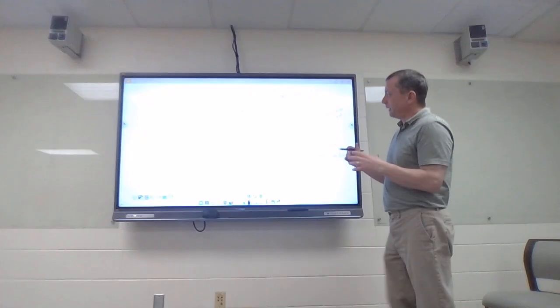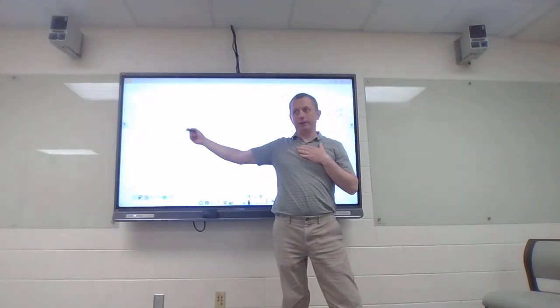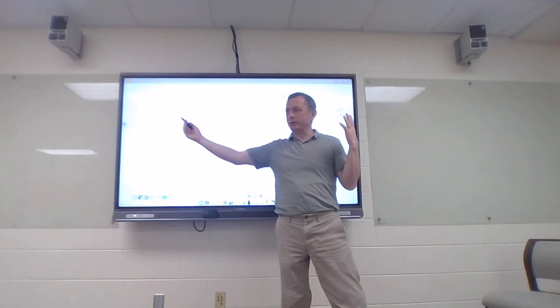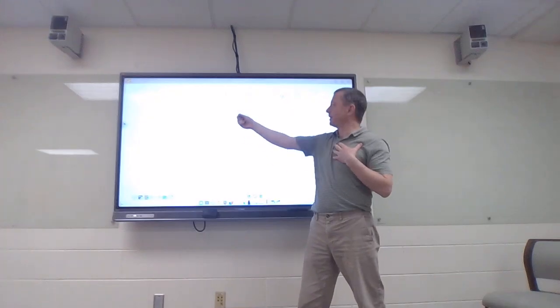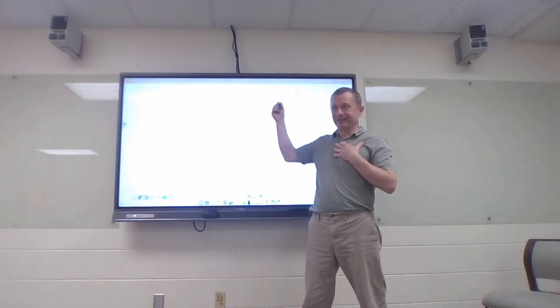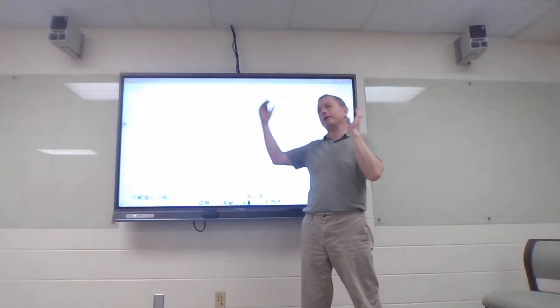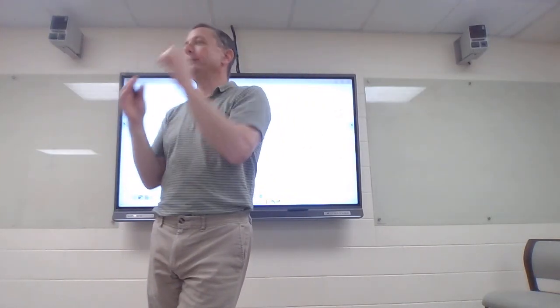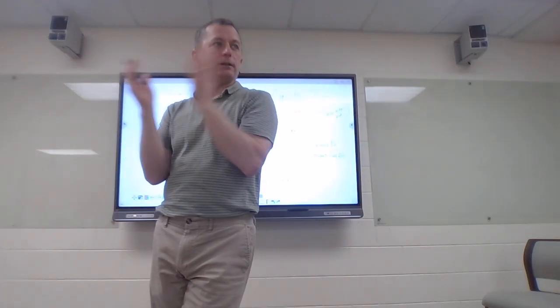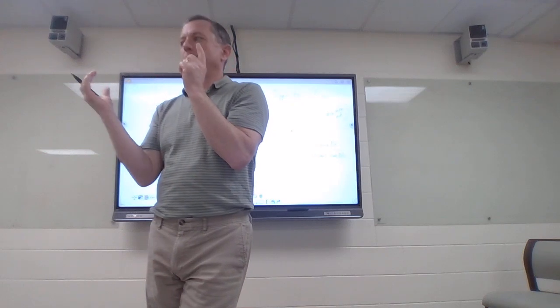All right? Now, I want to be clear. Most of the splitting we're going to look at is due to another hydrogen that's not the same, because if they have the same frequency, if they're all the same, they all kind of come together. It's a hydrogen that has to be different. If there's a hydrogen that's different next to it, that will cause splitting in my peak. What was normally one peak is now more than one peak. All right?